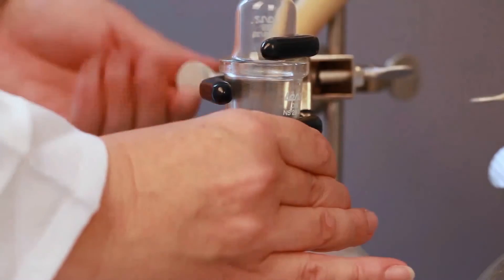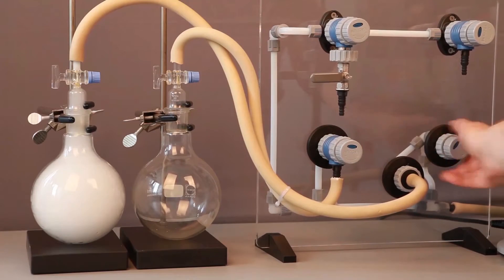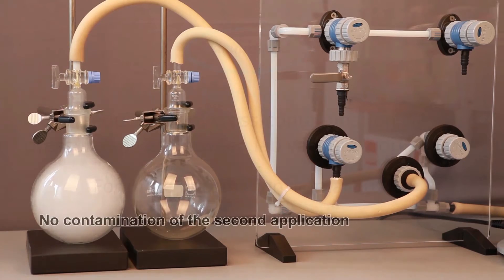As before, a smoke-filled flask is connected to one of the ports on the vacuum network. The VacuLand valve is then opened and as a result, the check valve prevents the contamination of the second flask.